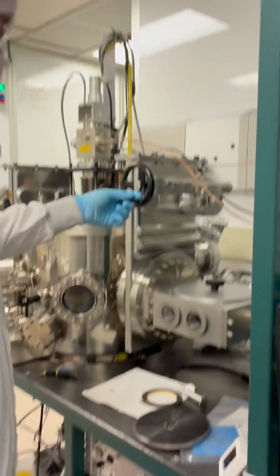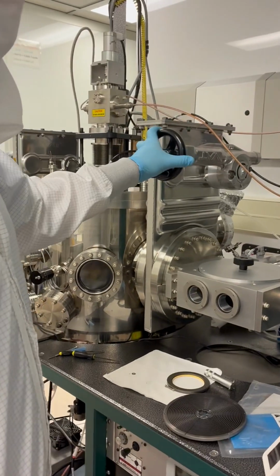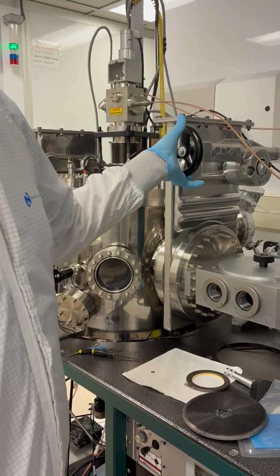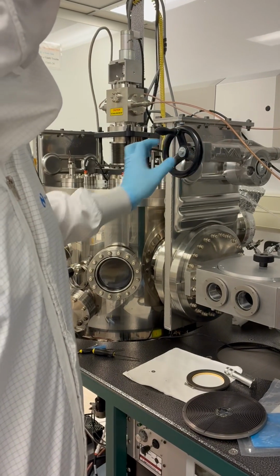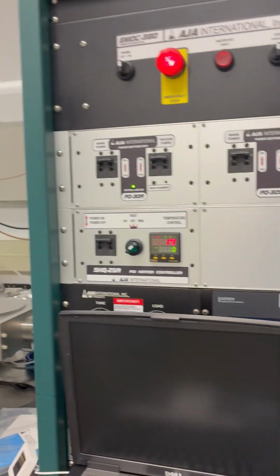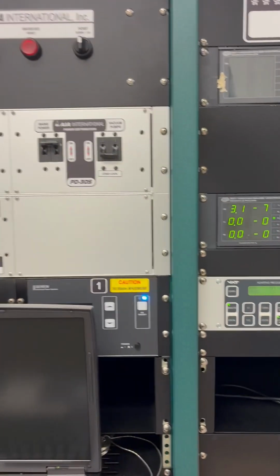Now you'll know this is closed because it'll stop, and if you can go farther, it'll click over like a torque wrench. That's how you'll know it's closed. And we can go ahead and turn the load lock pump off, and we'll wait for it to come up to atmosphere.